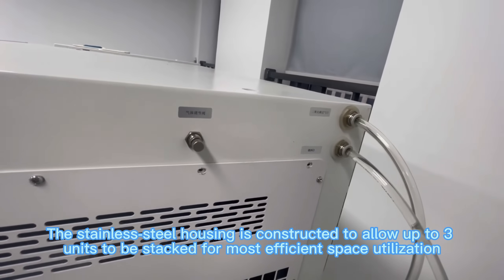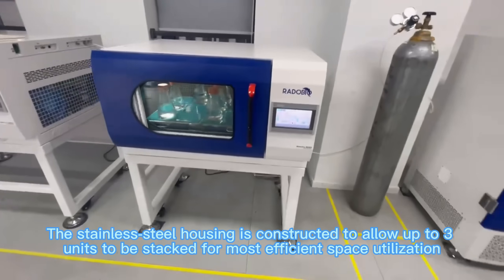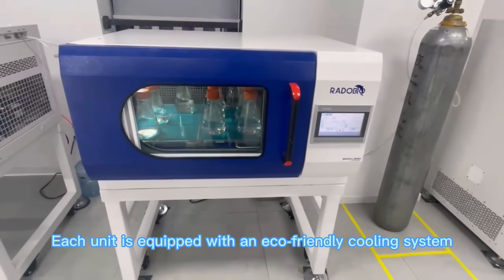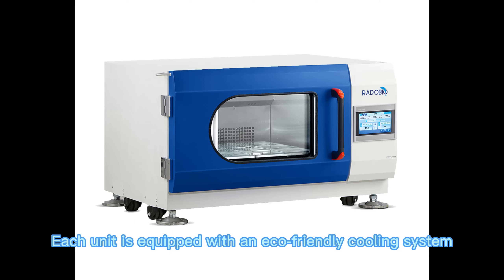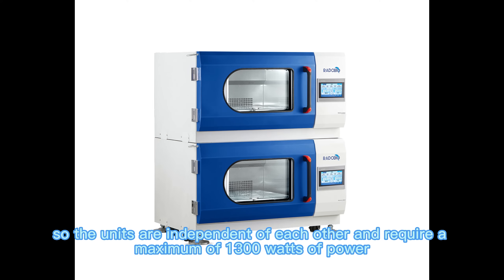The stainless steel housing is constructed to allow up to 3 units to be stacked for most efficient space utilization. Each unit is equipped with an eco-friendly cooling system, so the units are independent of each other and require a maximum of 1,300 watts of power.